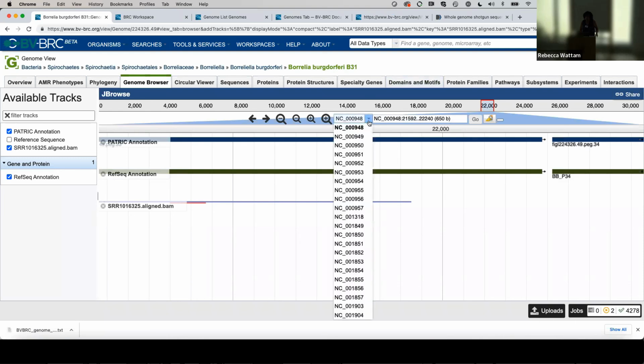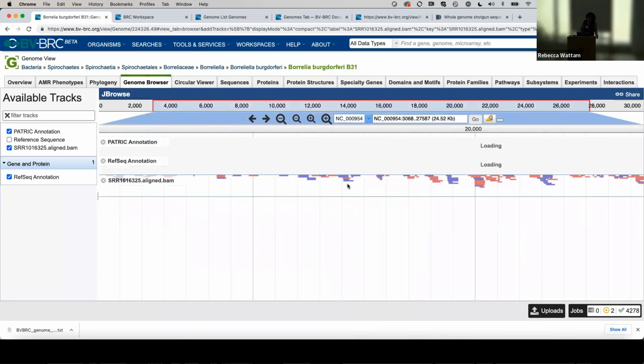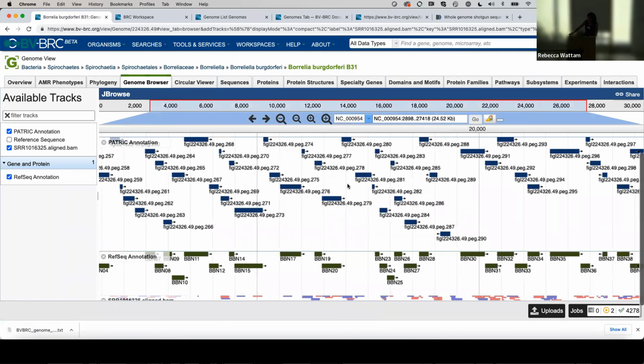But if we went shopping and went to something different, and who knows, so you click here, and then these are all the contigs associated with this particular genome. So it is not a closed genome because Borrelia is in a single, well, actually, Borrelia has a ton of plasmids. So it could be one of the plasmids. And if I were to click on that, but you can see that even though, remember that pie diagram and everybody got excited?